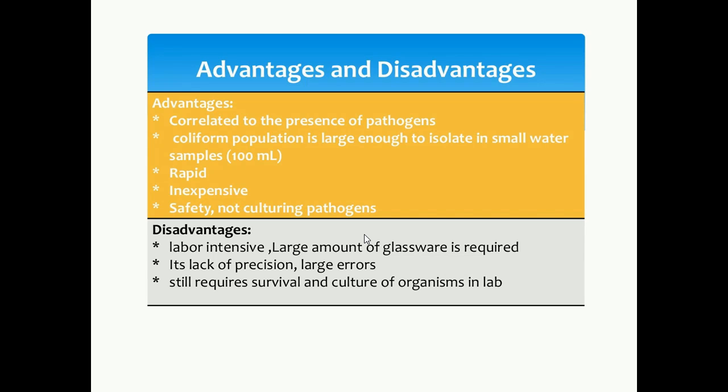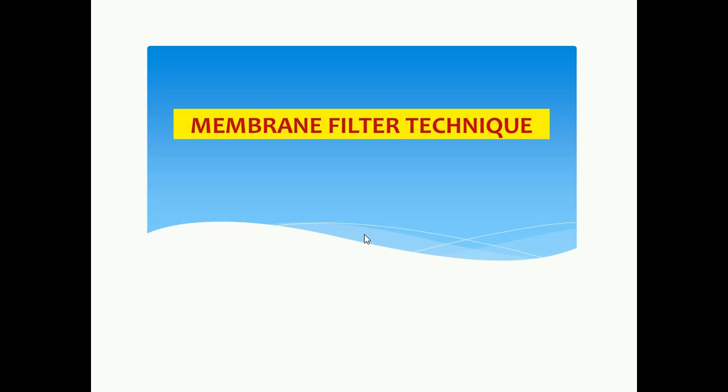Next one, disadvantages. Labor intensive, a large amount of glassware is required. It lacks precision, large errors, and still requires survival and culture of organisms in the lab. Next technique is nothing but the membrane filter technique.